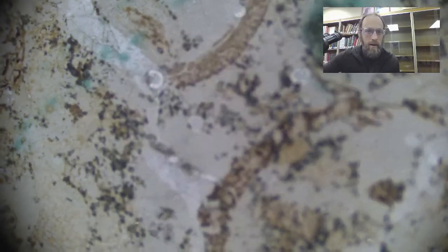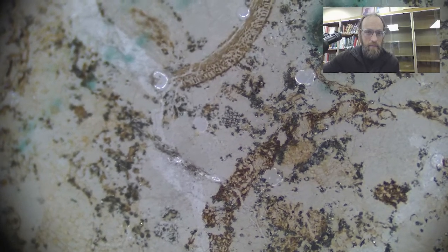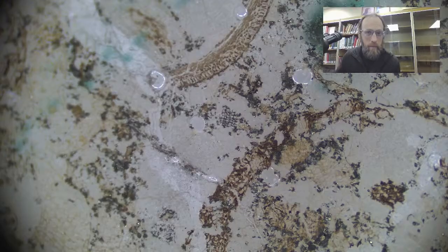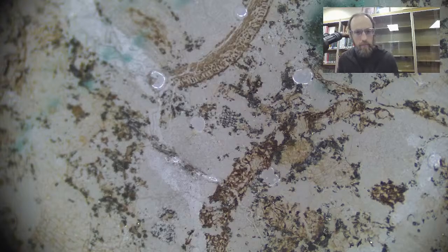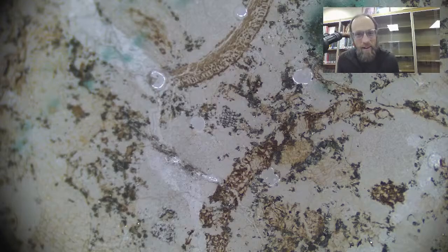At the very center, very small what's in focus, there's a bit of black cross hatching at the center of the view, and that is some kind of charcoal. So I'm going to take a photo of that. There we go. And then I'll wonder why did I ever take that photo? But yeah, continuing on.